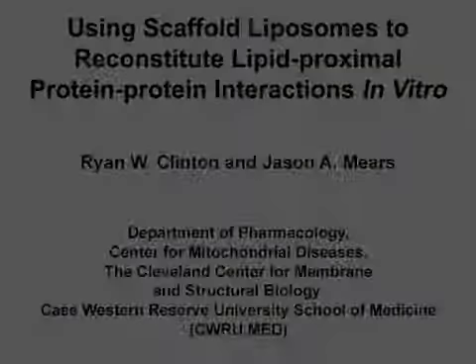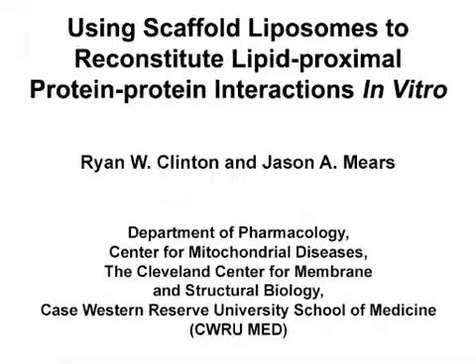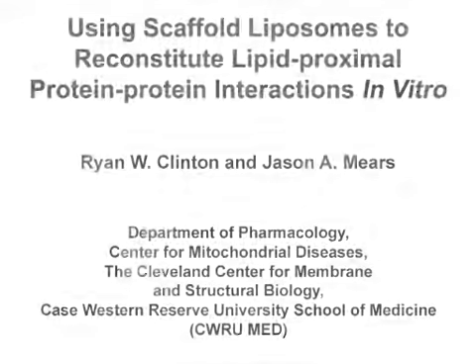The overall goal of this technique is to capture membrane-proximal protein-protein interactions in vitro. This method can help answer questions in the mitochondrial dynamics field, such as how protein-protein interactions at the mitochondrial outer membrane can be affected by accessory lipids.